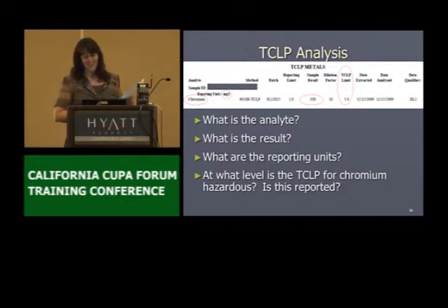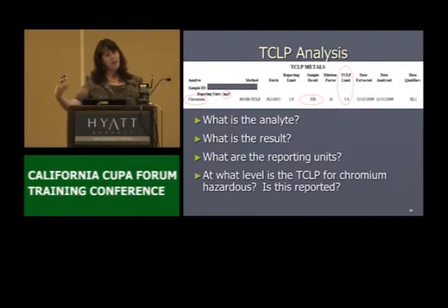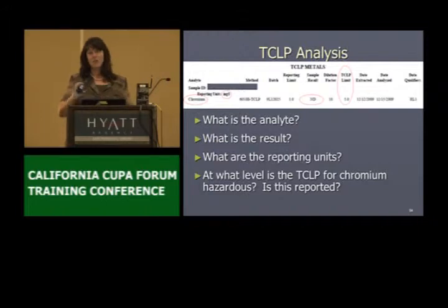It was on the previous slide, yeah, but it is here. If you see their TCLP limit, some labs put the regulatory threshold on the report itself, which is kind of nice. Some don't, so you do have to look it up or keep that table handy in your clipboard or in your notebook for your facility.